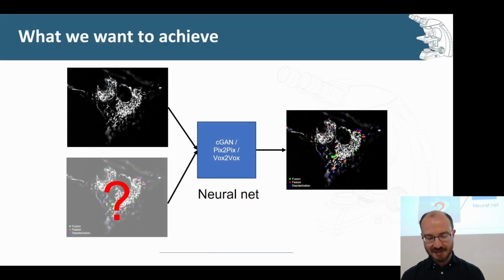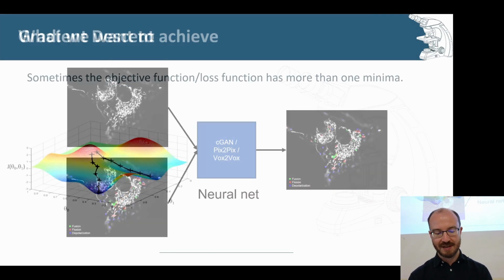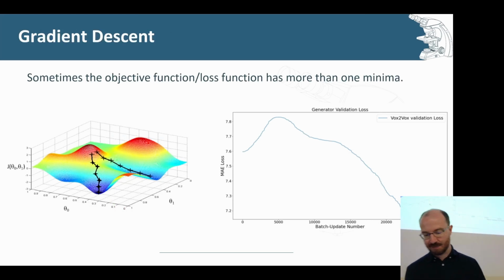Okay, back to this picture. We have now generated our ground truth. We've got a time-lapse sequence, and we've got our ground truth. We can go and train a neural network now. That's exactly what we did. I'm not going to go into the entire thing of neural network training, but usually as it trains, there's a loss that you're looking at. The loss is supposed to decrease.